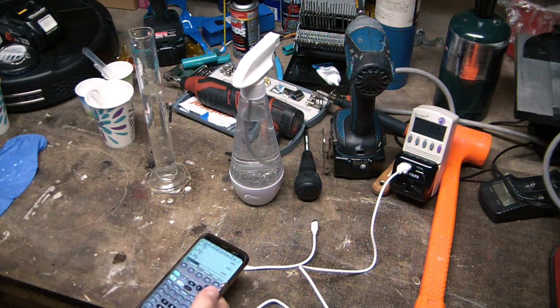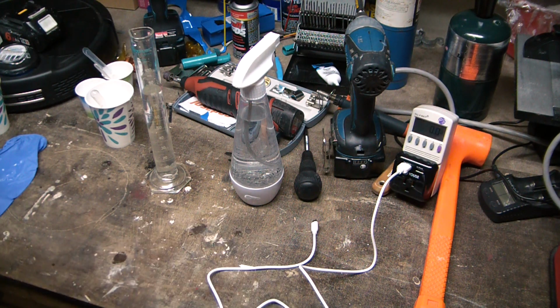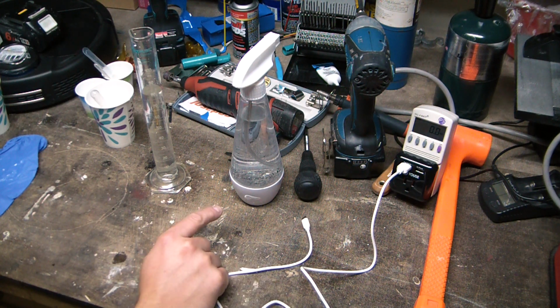So I think that would mean the original stock solution was about 1600 parts per million, which is pretty far over the necessary 200 parts per million to actually sanitize stuff. And it's even above the 800, literally double the 800 parts per million needed to disinfect something. So this is making some impressively high test chlorine here.